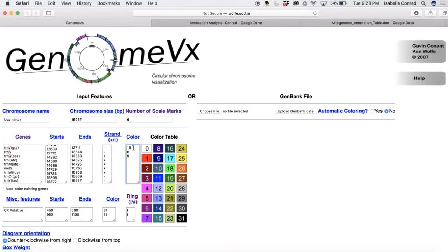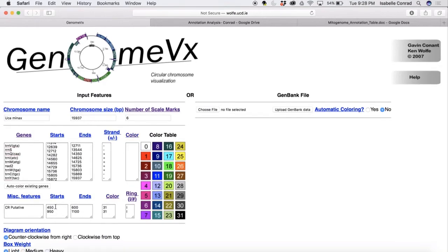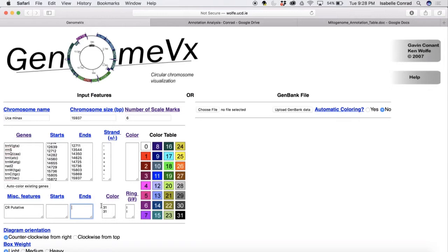So now we're going to delete the numbers under the color column and we will come back to the colors later. So now we need to find the start base pairs of the control region and the end base pairs of the control region. So we're going to go back to the annotation table to reference that.